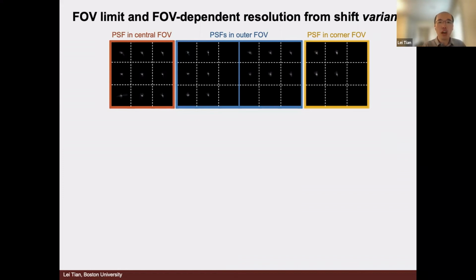but was from the V1. One of the things I mentioned was that the system is a 3 by 3 microlens array. It's actually not as simple as it sounds. In reality, when you build this kind of device, we just have a 3 by 3 microlens array, with nothing in between the microlens array and the sensor. So what you see is that at the central field of view, you have a 3 by 3. These are the single views. This dotted line is just to aid visual inspection of the data.